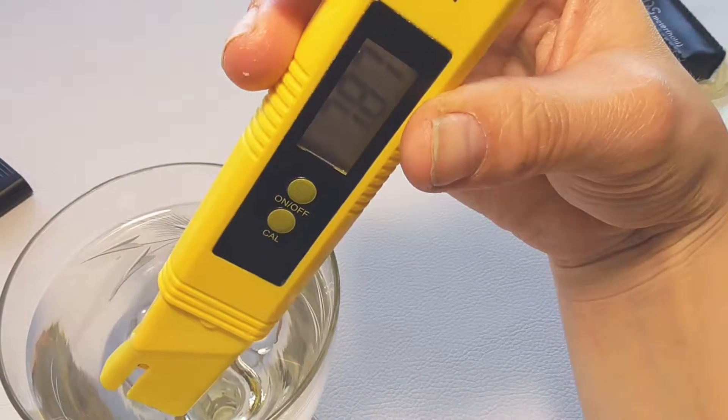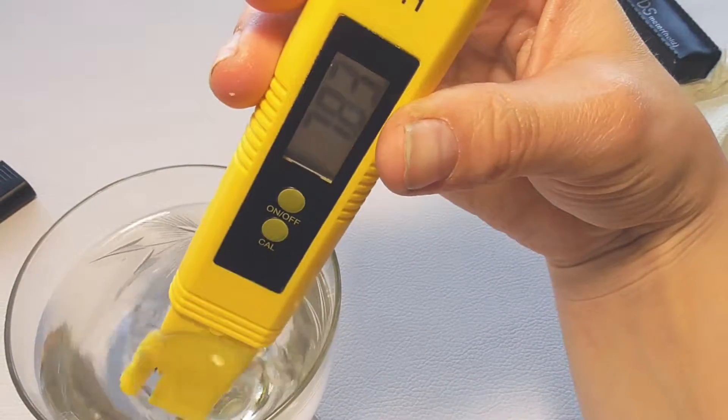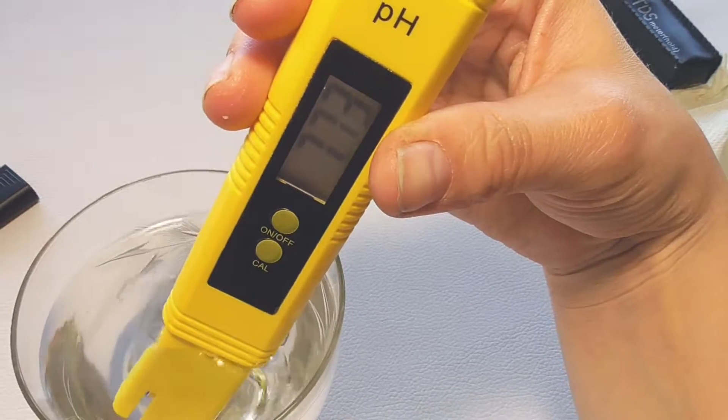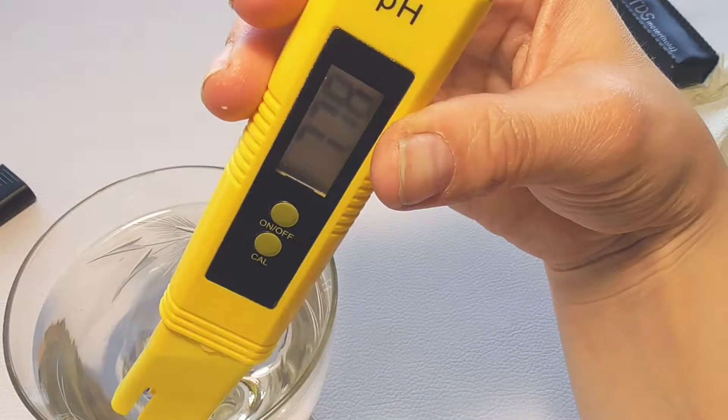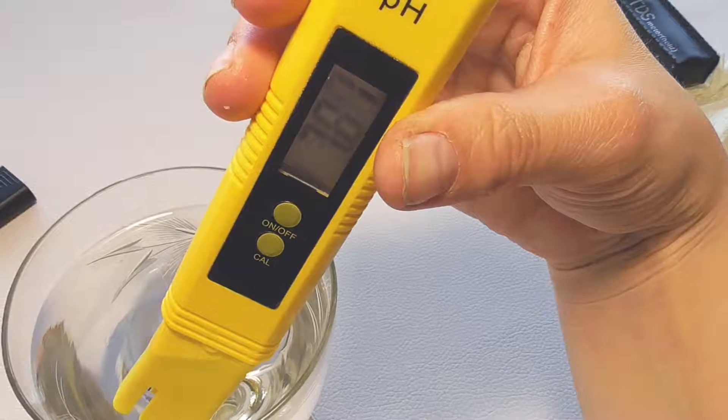or you're used to buying bottled water every day for drinking, then you can test the tap water to see what is the difference.